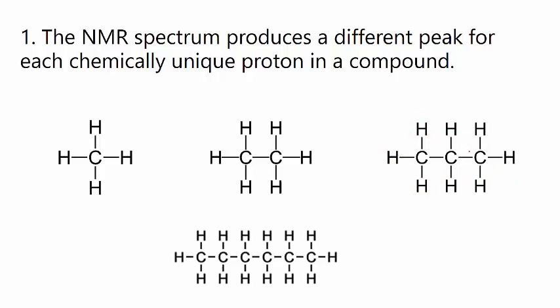In your prelab, you're asked to identify the 3 types of hydrogens in hexane.